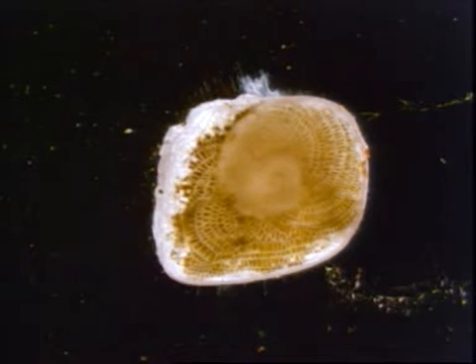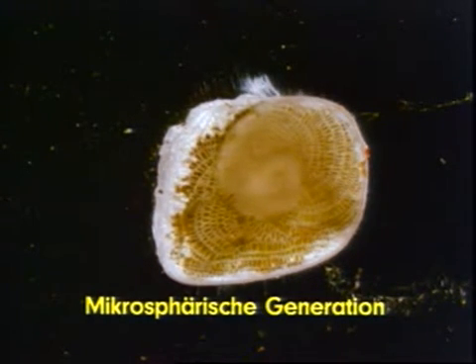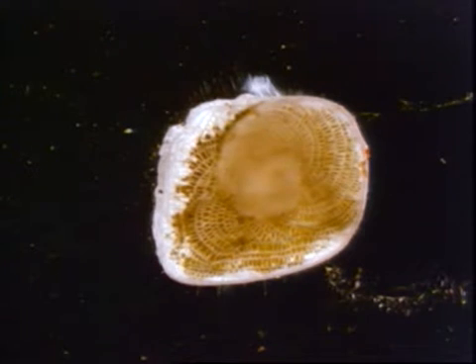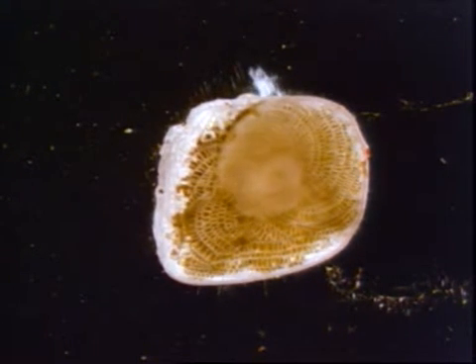From the peripheral chambers of this microspheric specimen, symbiont-containing protoplasm has retracted to the inner part of the test. This signalises multiple fission.